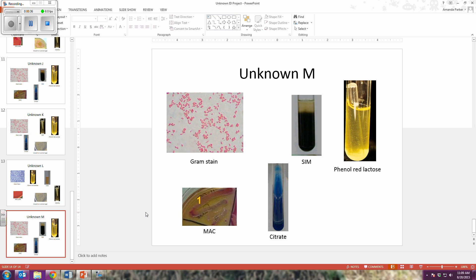The assignment this week is to figure out if you have a gram positive or a gram negative and figure out the shape. This is the only image you'll need this week. So I would look at this and figure out if I have gram positive or gram negative and what my shape is from the image.